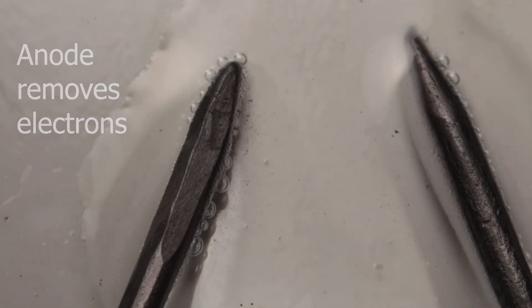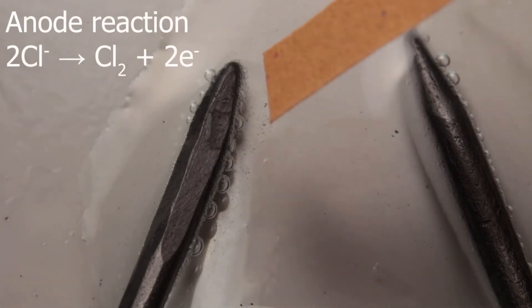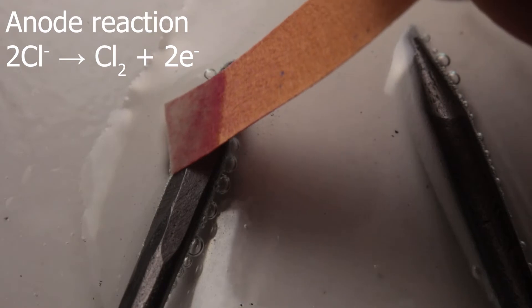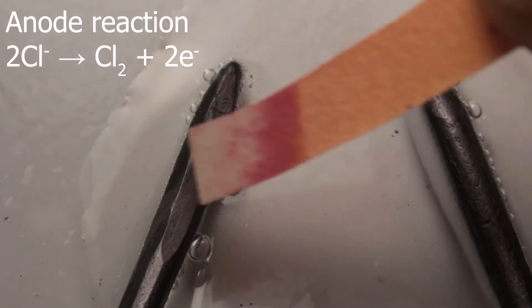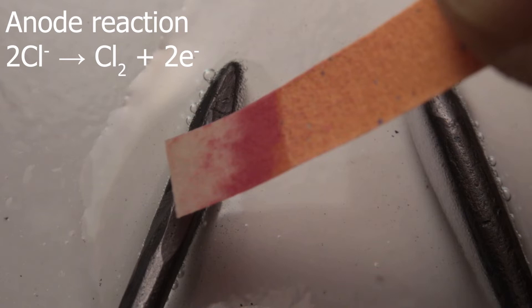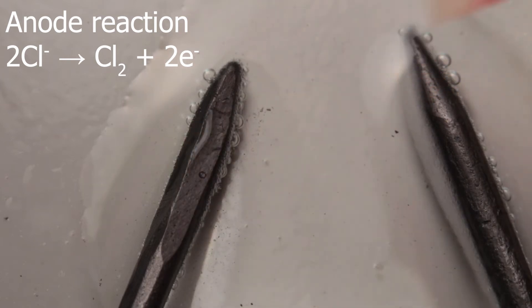At anode, removal of electrons would take place. Here chloride ions are being oxidized and chlorine gas is formed. The test for chlorine gas is bleaching of indicator paper, which you can see here.